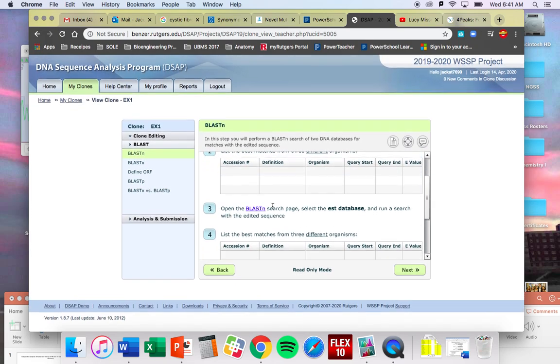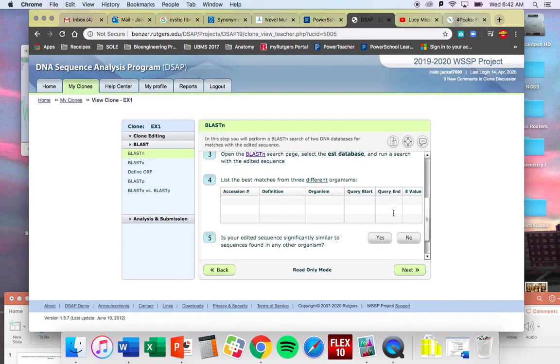Then you get the BLASTN EST database, which is specifically coding genes, meaning genes that code for a protein. So in this BLAST database, you narrow your search pool, which improves your accuracy. Okay, so we got these two BLAST searches, and then of course you have a BLASTX search, which it's not going to let me go to the next page, but the BLASTX search is going to take your nucleotide sequence, convert it into amino acid sequence, and then search the pool of known protein sequences.